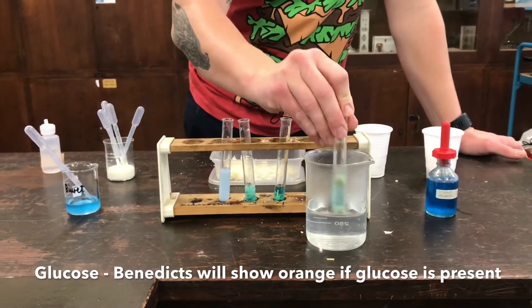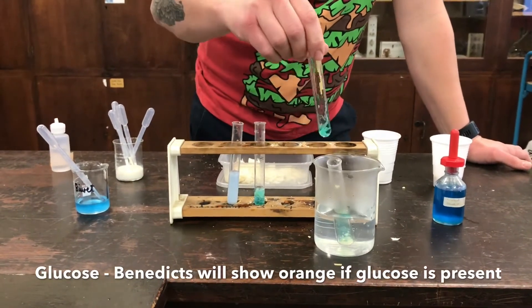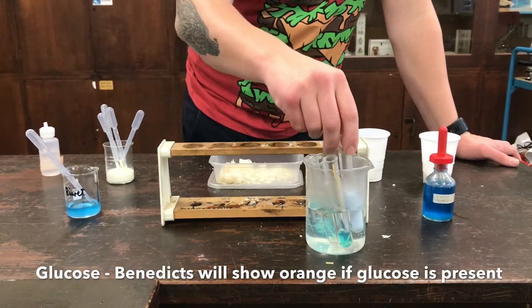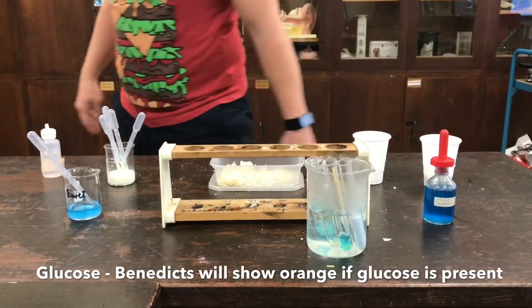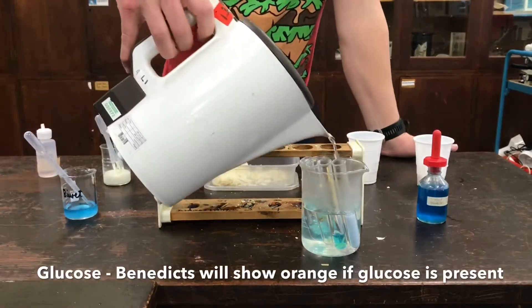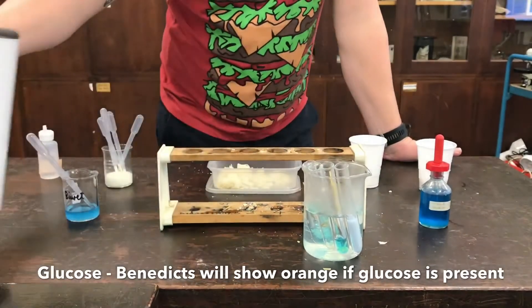Now this could take some time. Give it a little mix, and in I pop each test tube into the hot water. Hopefully bringing them up to temperature should show an orange result where glucose is present.